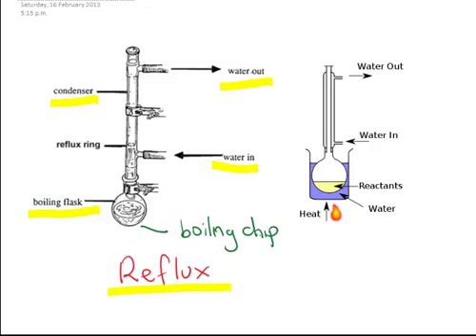As we're heating these reactants in here, it turns into a gas, goes up here then cools down because the condenser has basically like a sleeve that wraps around this tube and it cools the gas so it can fall back in. Notice there's no kind of lid on the top here or stopper because we don't want pressure building up. That cooling process means that the gas will get cooled down, dripped back in and we can continue on trying to react this for a long time.